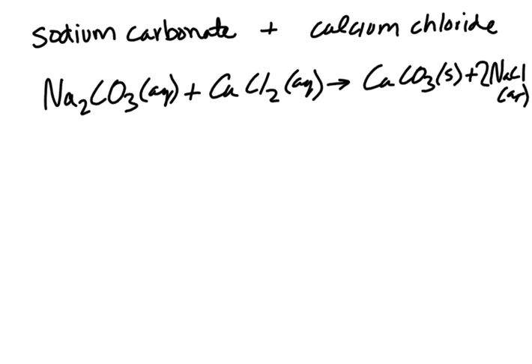Okay, this is what you should have. You should have sodium carbonate with calcium chloride forming calcium carbonate, which is a solid, and 2 moles of sodium chloride, or at least the molar ratio there. All right, so there's my equation.